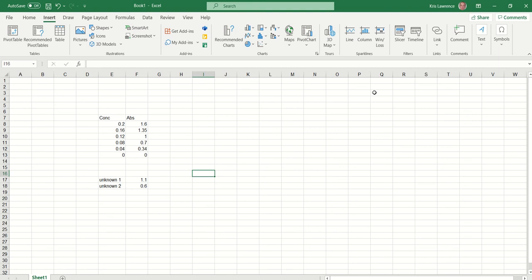Hi and welcome to this video from P-TECH Applied Science Level 3, Unit 2. What I'm going to quickly do is go through how to use Excel. In the time of lockdown, some people don't have graph paper at home and are struggling a little bit with computer software. Depending on the version of Excel you're using, your buttons might be in slightly different places, but there are plenty of tutorials on YouTube. I'm going to be using the 365 version via the college systems.